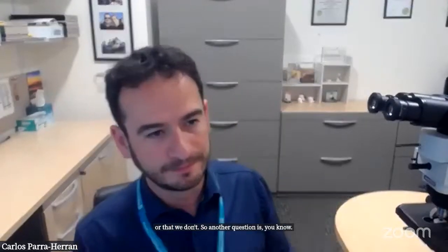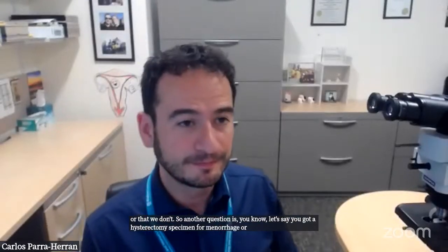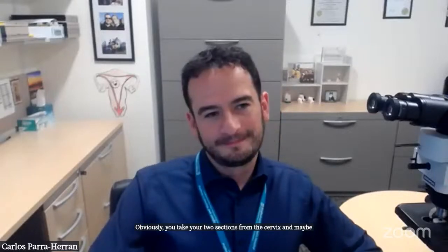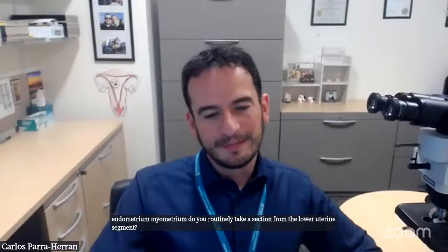So another question is, let's say you got a hysterectomy specimen for menorrhagia or prolapse, and there's nothing to see grossly. Obviously you take your 2 sections from the cervix and maybe 2 from the endometrium, myometrium. Do you routinely take a section from the lower uterine segment in those cases? In my institution, we do.